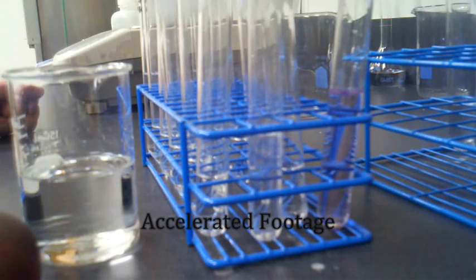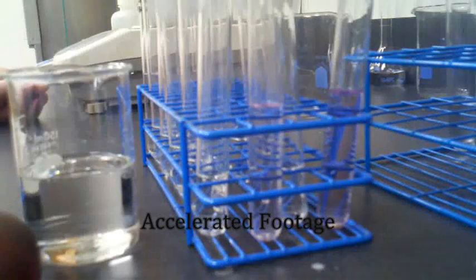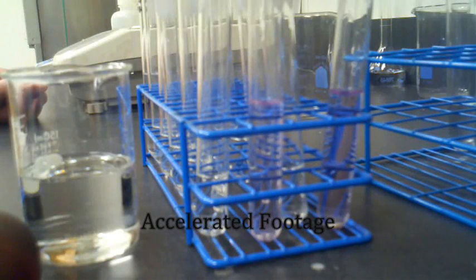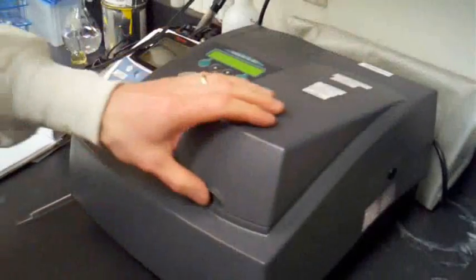This solution is then mixed with chromatropic acid and sulfuric acid to cause a color change proportional to the quantity of formaldehyde in the solution. The quantification of this color change is measured using a spectrophotometer and compared back to a calibration curve relating color to formaldehyde.